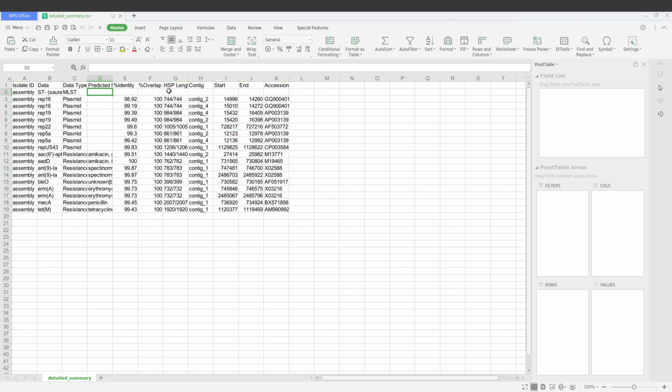So we are going to do everything on the command line. With spreadsheet software, it's easy to do, but we will still do everything on the command line, because ideally, if you're working on a Linux system, then you should be able to learn how to do some of these things there. They become very crucial, and they are very handy, by the way. So let's get back to the command line.